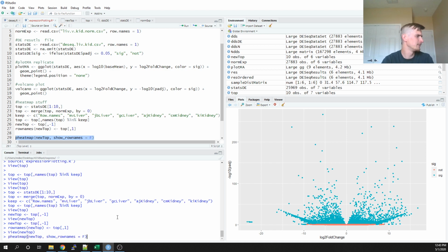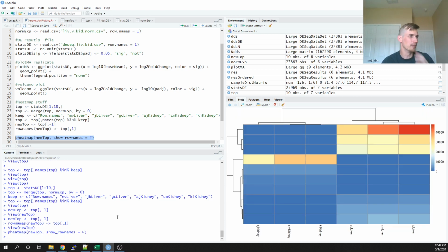But this lets me talk about some other things. That doesn't actually look that bad. It's not the worst thing. But either way, these numbers are assigned to a column, and each value is assigned a color that gets measured between 0 and the top number, and it gets scaled on this top number.